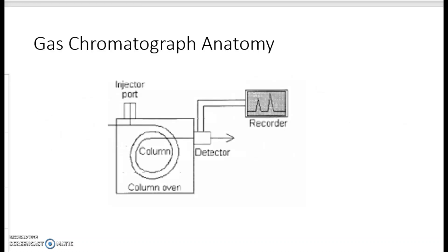Thinking a little bit about gas chromatograph anatomy — essentially this is what we have. We inject the sample into the column, and on our equipment, room air is our carrier gas that comes in through this side. The vapor and the air move through the column at different speeds until they hit the detector.